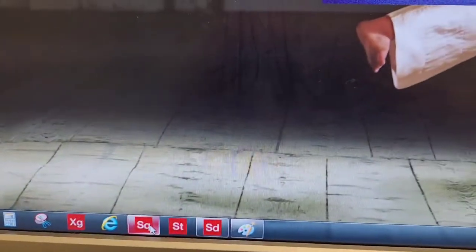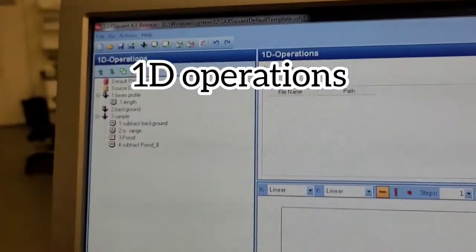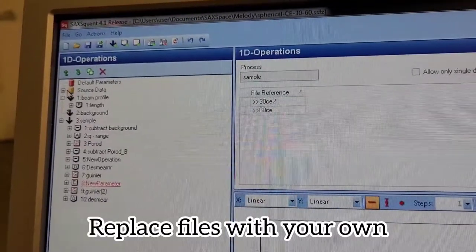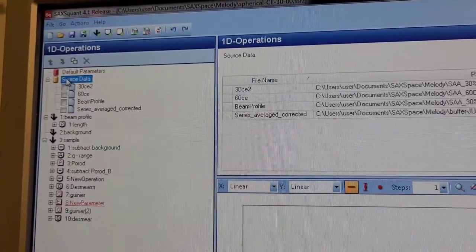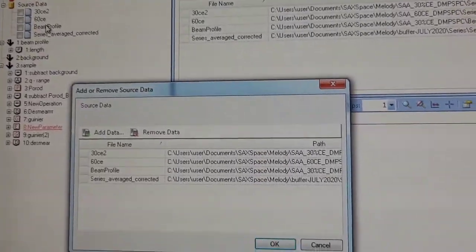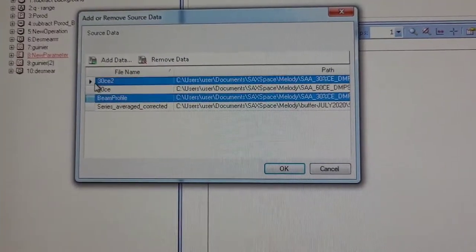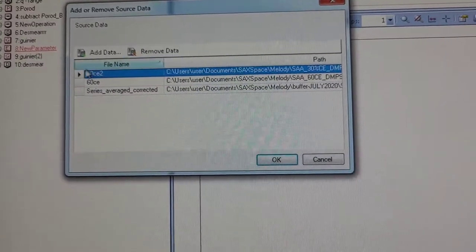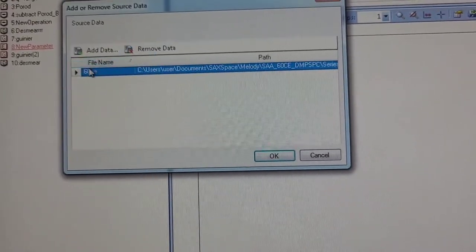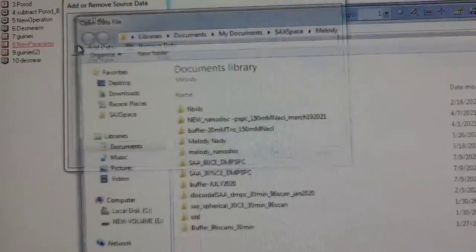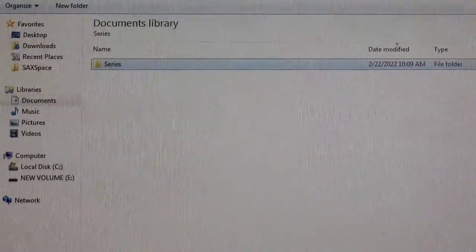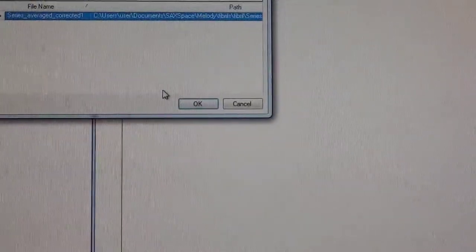Then you open SAXSQuant Software. Go to 1D Operations. Unless you're the first person that is doing this, somebody should have a processing file from before. So it's easier to open something from the past. Then you will delete the sample information and the buffer and everything that they loaded. Remove data from that file and then you add the data from what you just acquired. Your sample file and your buffer file, and these should be a PDH file.